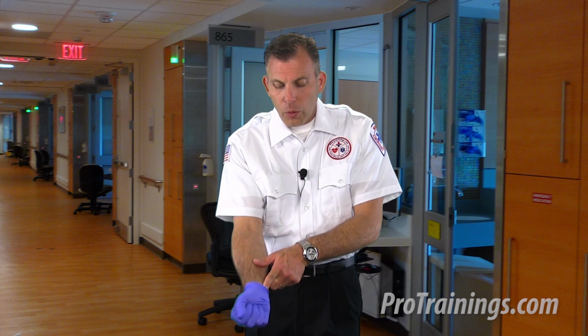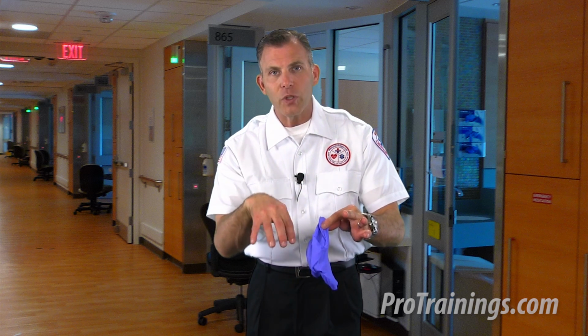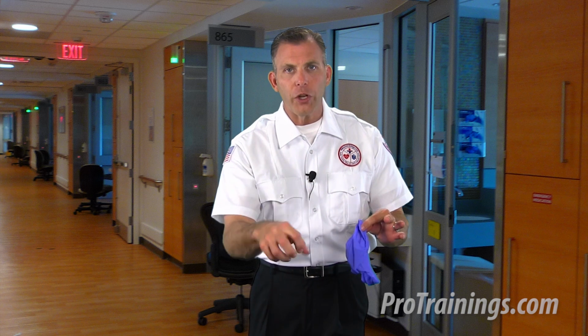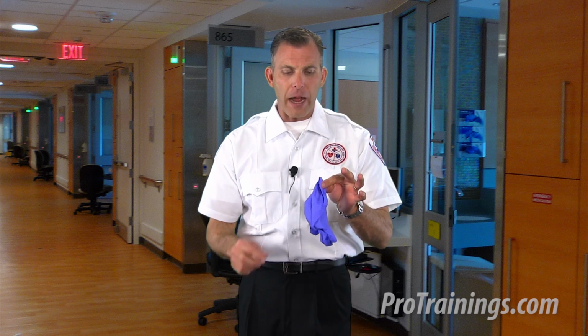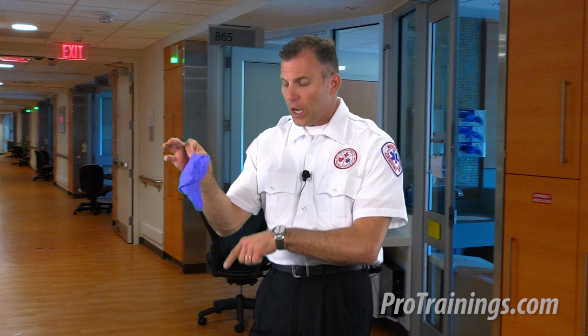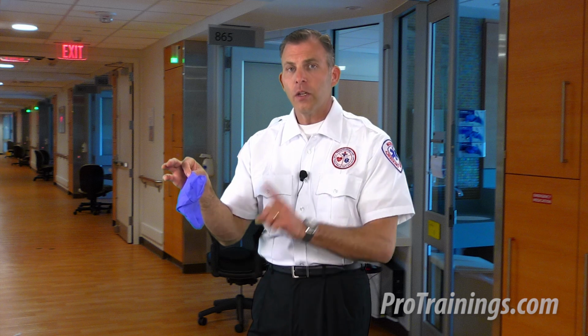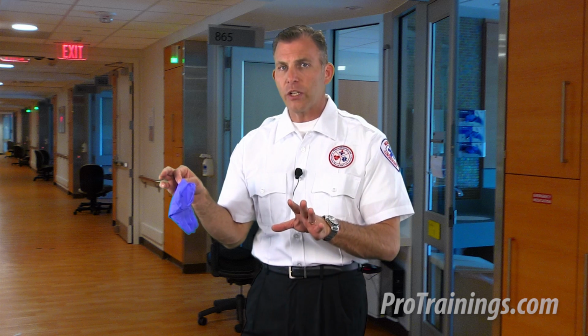And here's why. Now when I do the skin on skin removal, look at, when I remove that, it encapsulates the waste. If I've got a bloody gauze in my hand, that's now two gloves in, and it's rolled into the inside pocket. Now I use ideally a handless waste can. Make sure that you have the appropriate container or the appropriate liner per your regulations, and then into the appropriate trash it goes, and we're all set. After this, make sure we go and appropriately wash our hands or use rubbing alcohol as indicated.